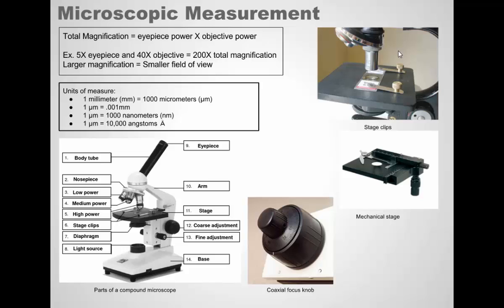Here's just some things to look at. This is the older style stage that just has two clips that hold the slide in place, and you have to move the slide by hand. The microscopes we usually use have the mechanical stage, in which, like I said, the two knobs - one moves forward and back, one moves left or right. These are nice, but I will tell you they break really easily. They're always coming apart, and sometimes things don't move and things get bent. So they are nice because it allows you to just very smoothly move things around or move it a small amount, but sometimes they break pretty easily. So the stage clips are simple.